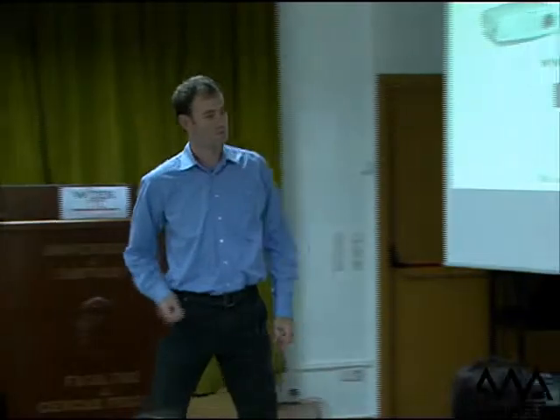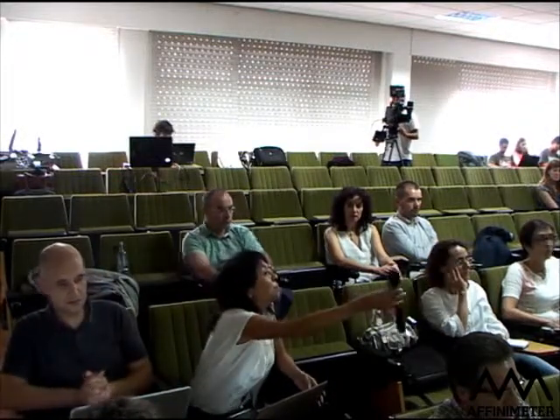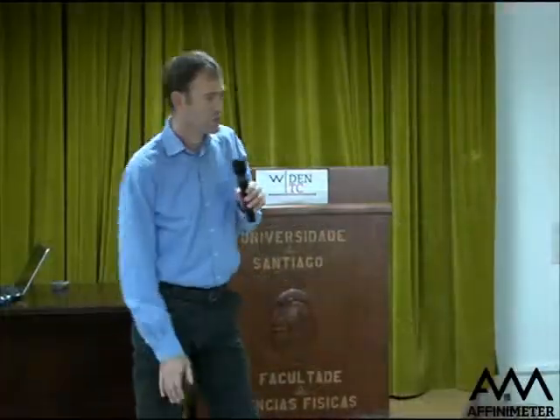I think this is the last question, from Neela from Pennsylvania State University. She's asking, is uniform size distribution of a nanoparticle crucial for good ITC data? No, it's not for good ITC data, but it does become important for the interpretation of the data.